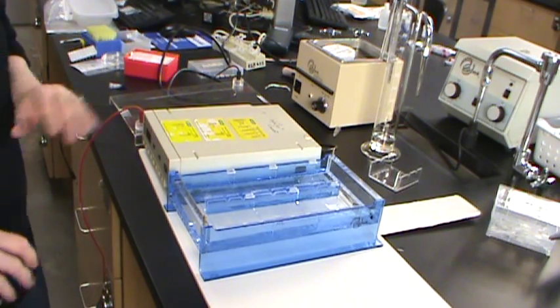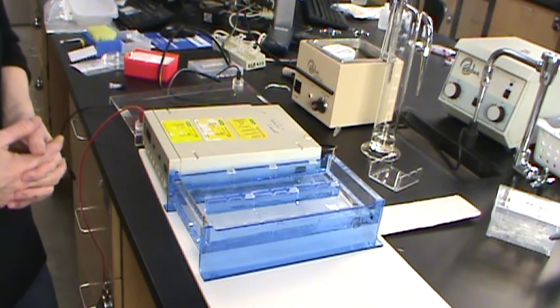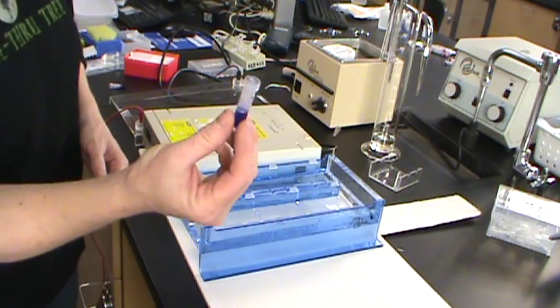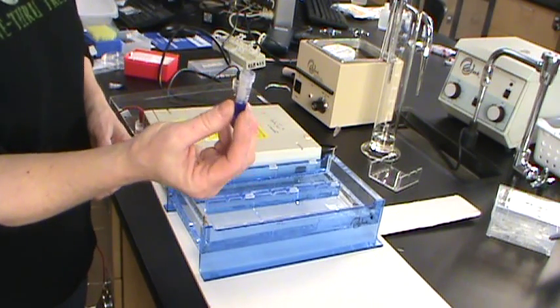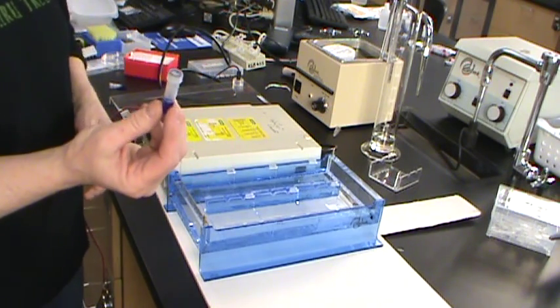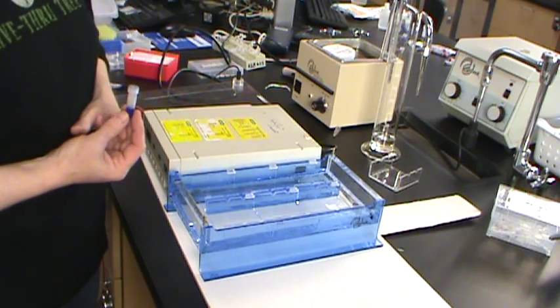Now, while you're waiting for your samples to incubate, you can use this practice loading solution to do some pipetting into these wells. That's a good idea so that you have practice and make sure you haven't punctured the wells and things like that.